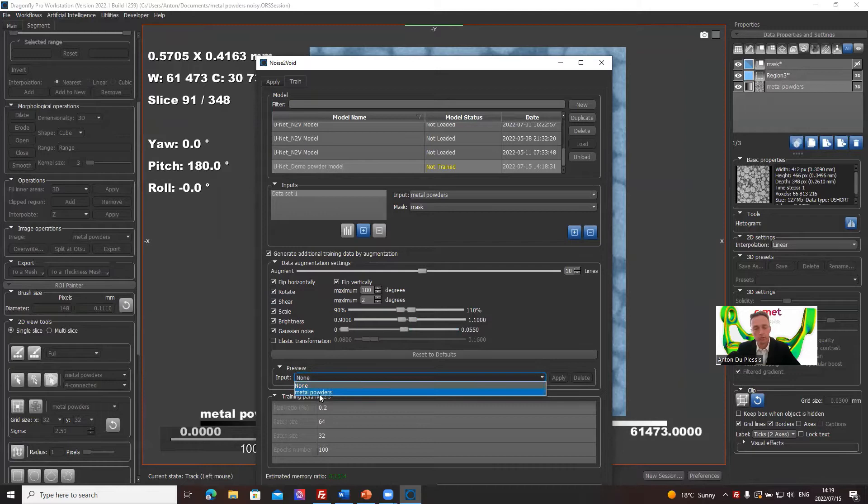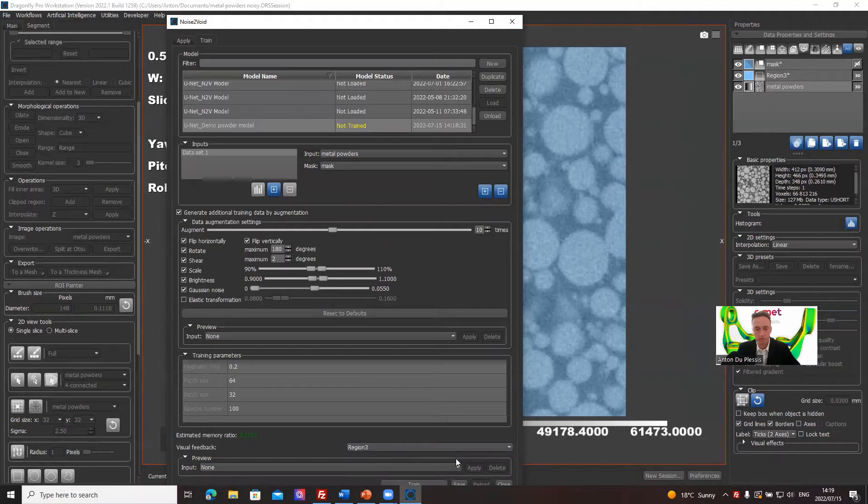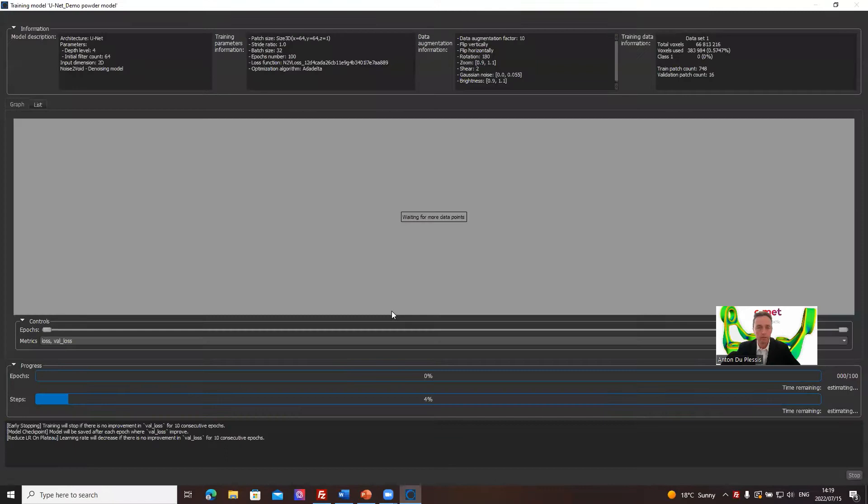We're going to add also a visual feedback frame, not a preview, a visual feedback frame region three. And then once we've set that up, we can train.